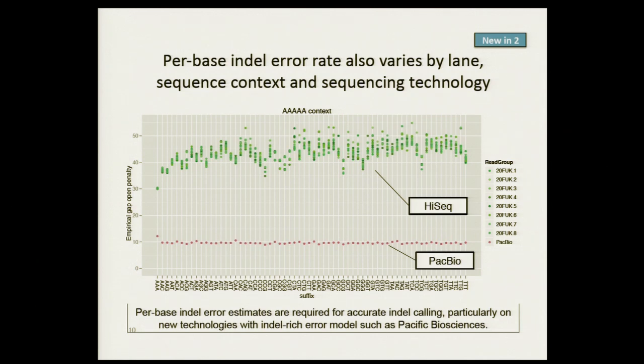Okay. So contrast that with PacBio. PacBio makes way more indel markers in their reads. So many that most of them are in fact wrong. They're correct at a rate of Q10, very low. But what's great about it is that it's completely unbiased. It's beautifully unbiased by sequencing context, right? So you don't have these systematic problems where you'll find mutation calls in a certain context, and you're not sure whether they're real or not, whether there's this bias based on context. Does everyone understand the contrast?